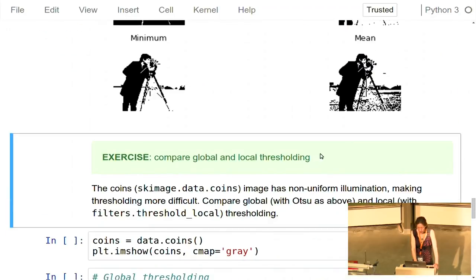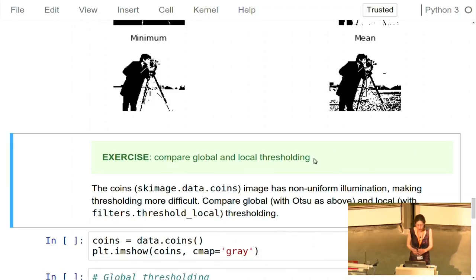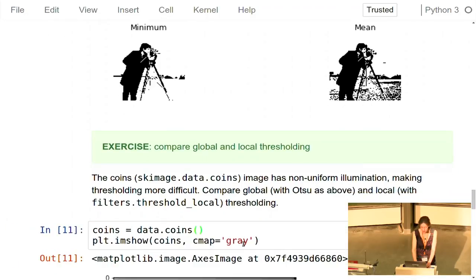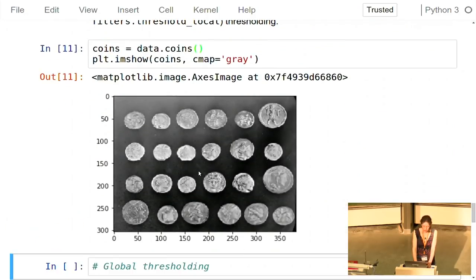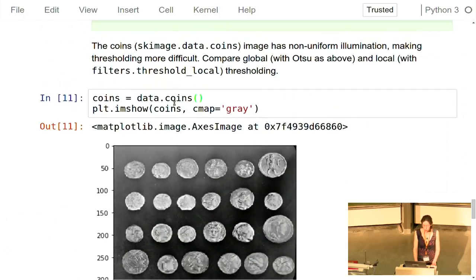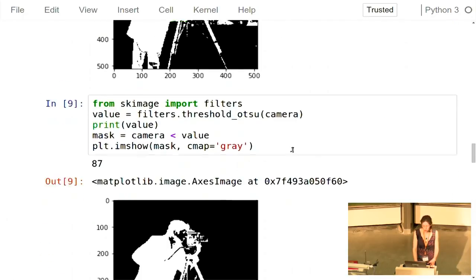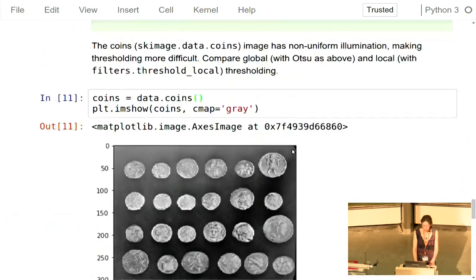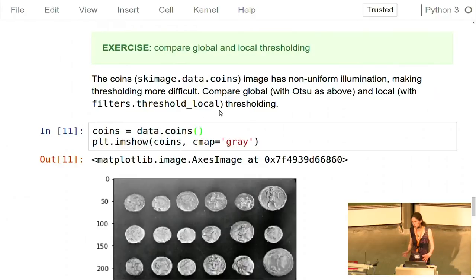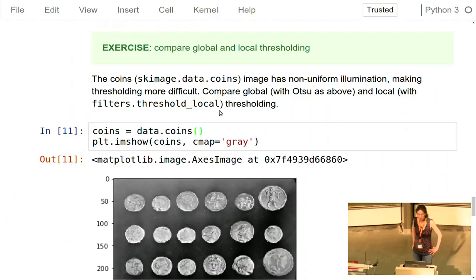For the exercise: instead of one global threshold for the whole image, you can have a threshold that varies spatially. In the data.coins image, the background is quite dark on one side but lighter on the border, making a single global threshold difficult. I ask you to compare global thresholding — applying the Otsu filter to the coins image — versus using the threshold_local function for local thresholding, and compare the two results.